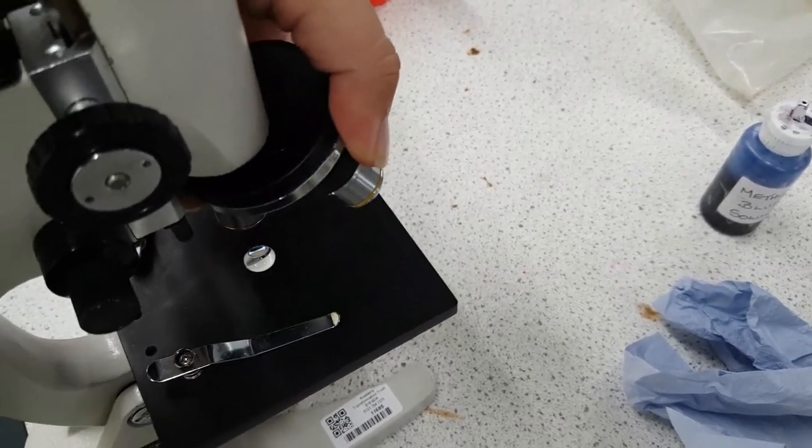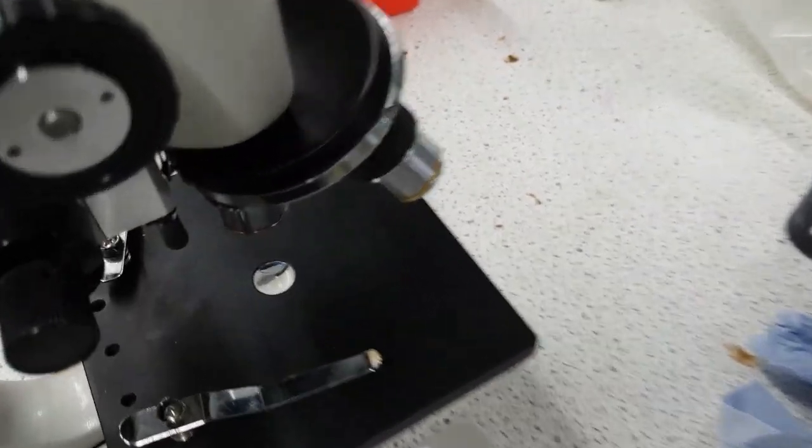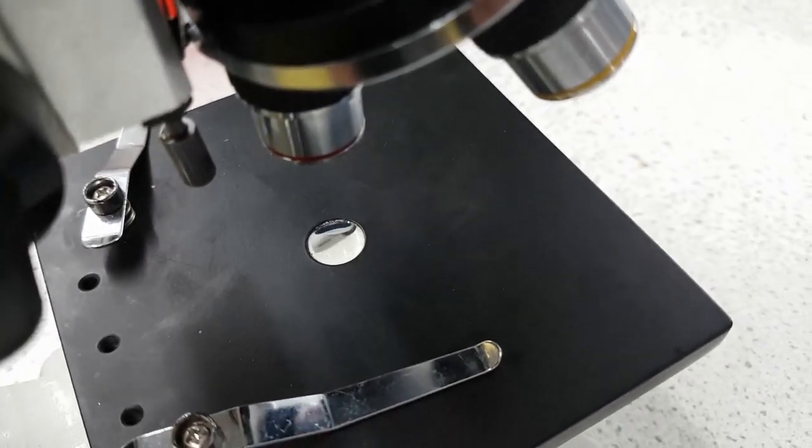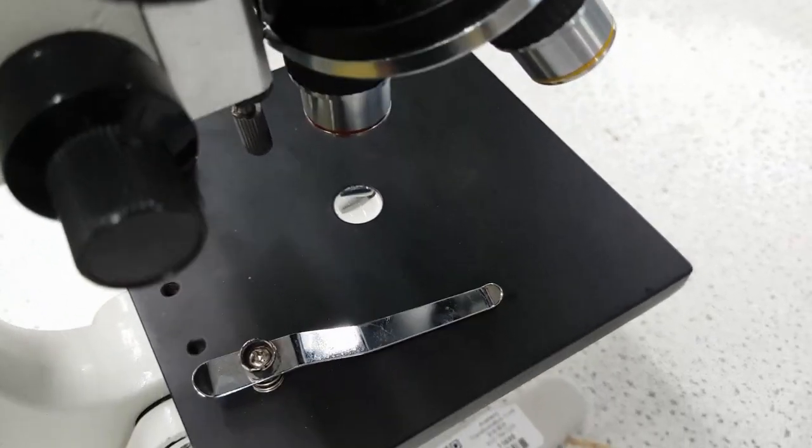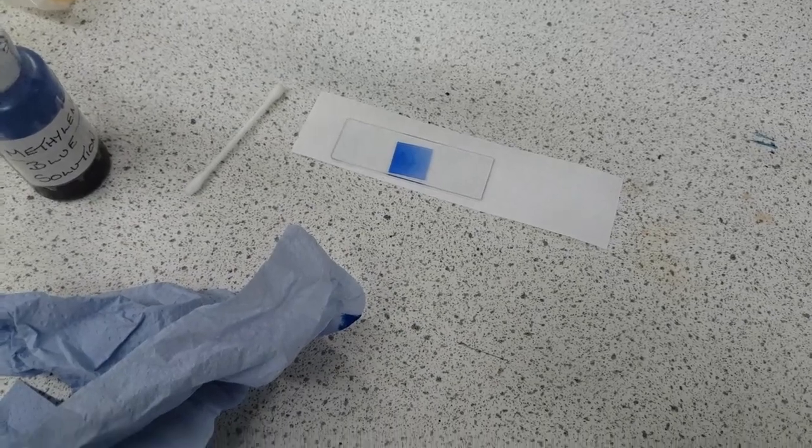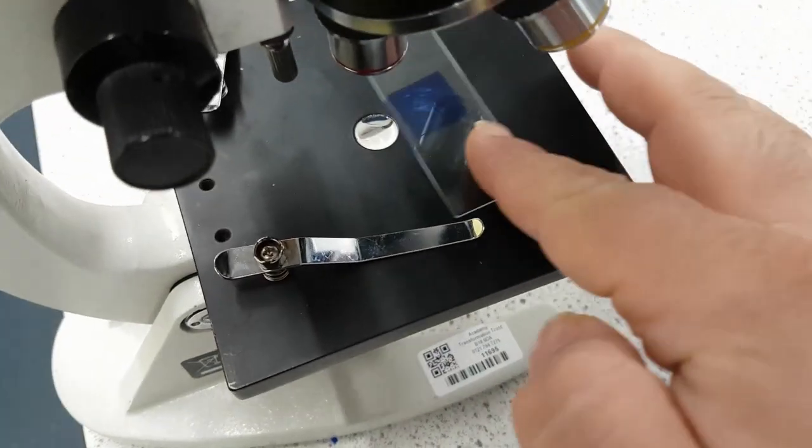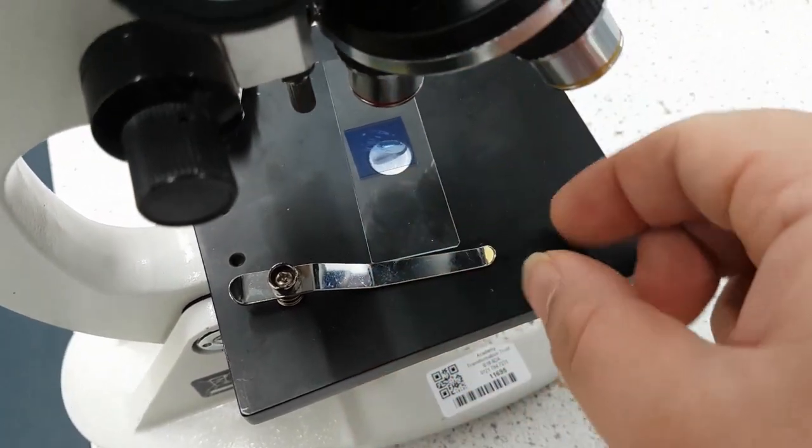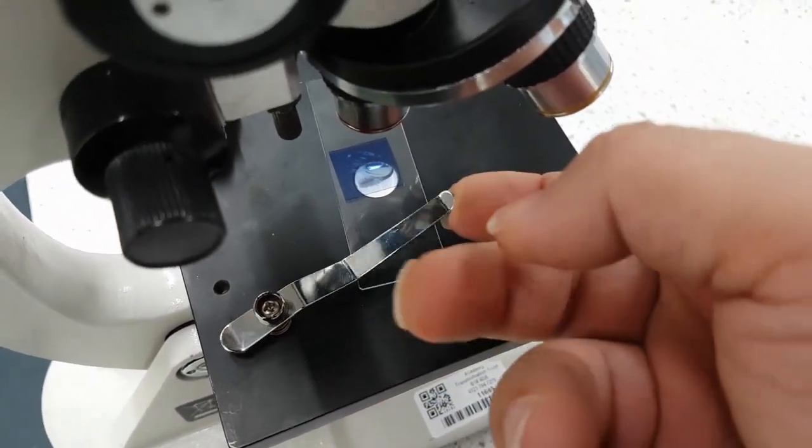And it's clicked in at the lowest magnification one so that's the red objective lens. Then what you do quite simply is you take your slide and you place it onto the stage and you can secure it with these here.